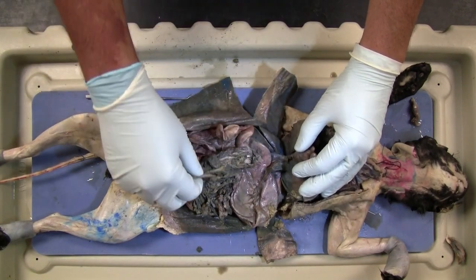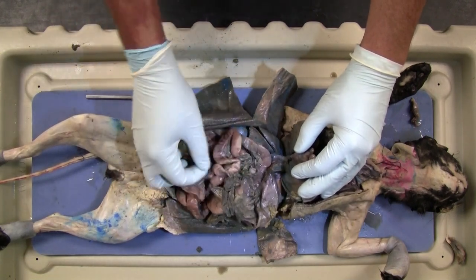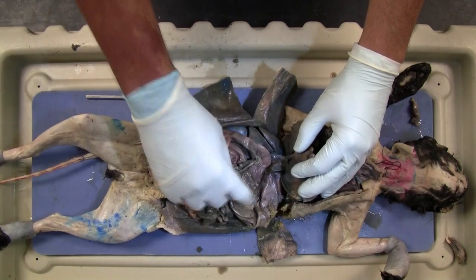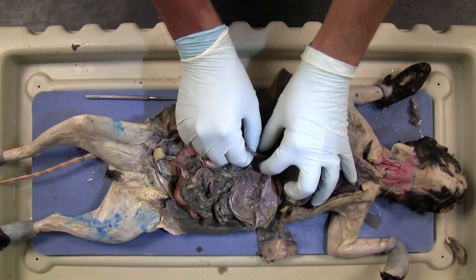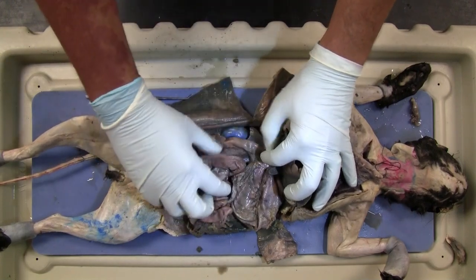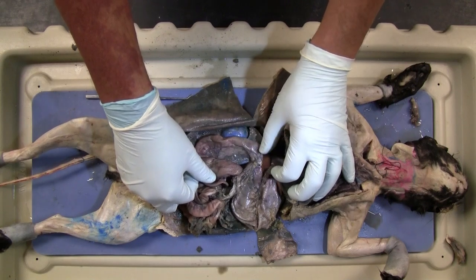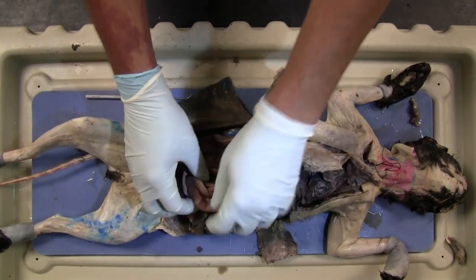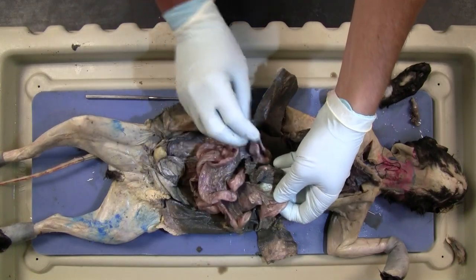And to find the duodenum, you first find some of the intestines, and you find the stomach coming over, and this first part of the intestines coming out, this C shape right here, is your duodenum. All of this right here would be your jejunum.